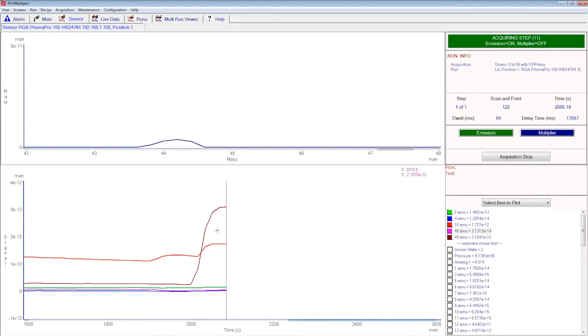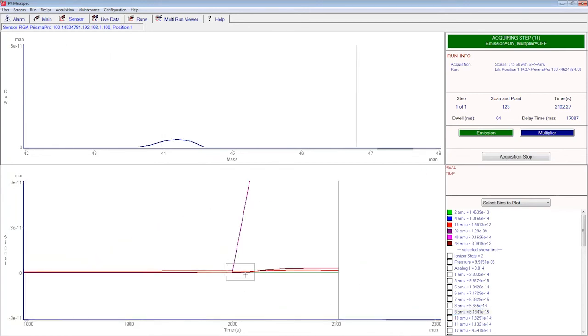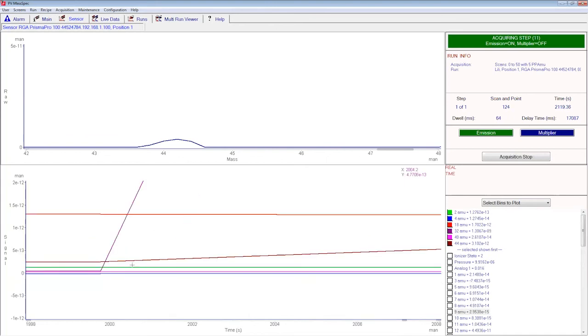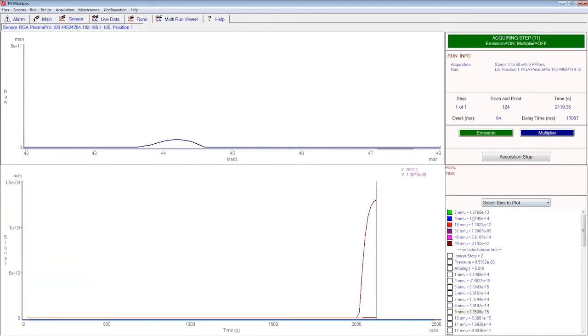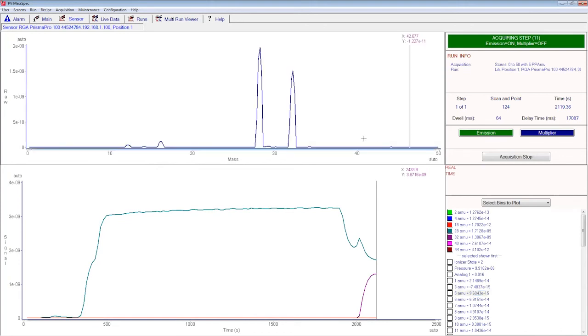So even at room temperature, the CO oxidation on palladium already works, because this was the moment where we introduced the oxygen. If you go back and display 32, you see exactly the line from oxygen. At the same time, of course, the conversion is very low, but CO2 starts going up. So it really works at room temperature. If you heat up the sample, it will be even more obvious. We are going there. Maybe you can start heating.